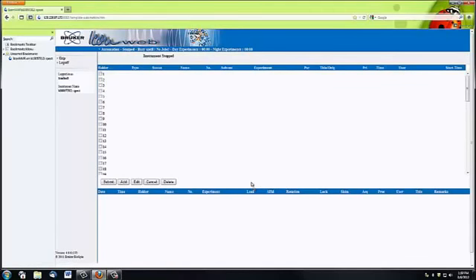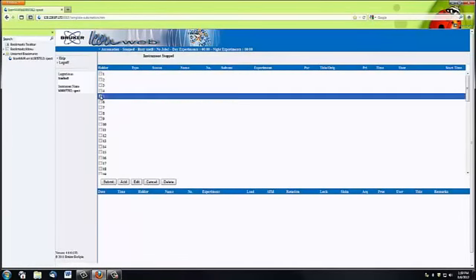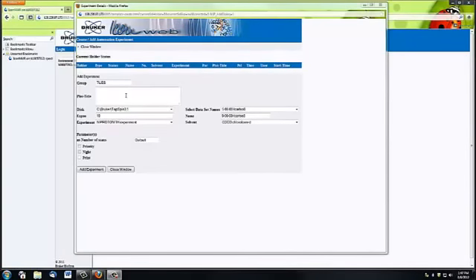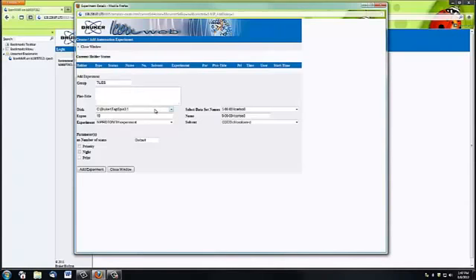And you'll need to select your holder number that you've been given in lab, check the box, and click Add. Next, you'll need to choose a title for your spectrum. This title will be displayed on the spectrum itself once processing is complete. Here, we see the directory and experiment number under which your experiment will be saved. You don't need to change these.